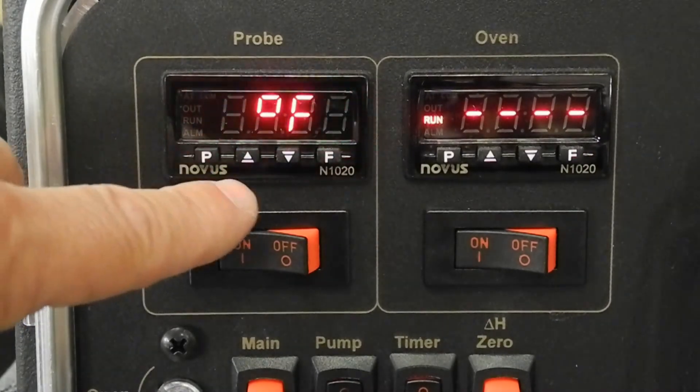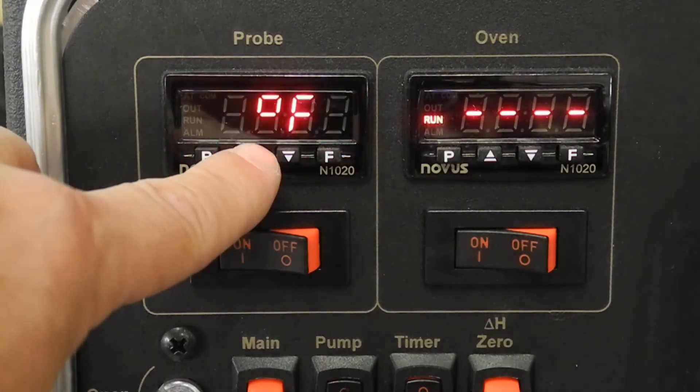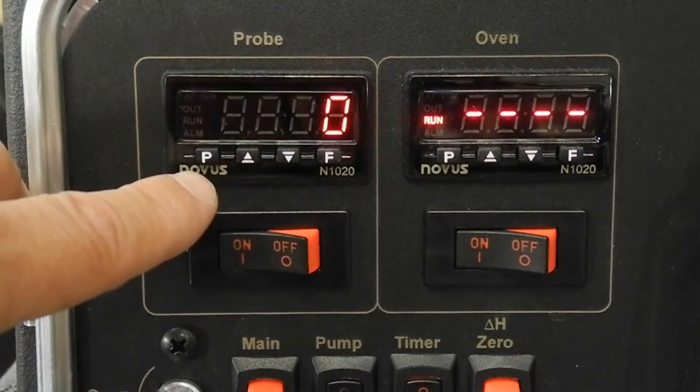Tap the P key to reach Unit. Tap the incremental key to select F for Fahrenheit or C for Celsius.